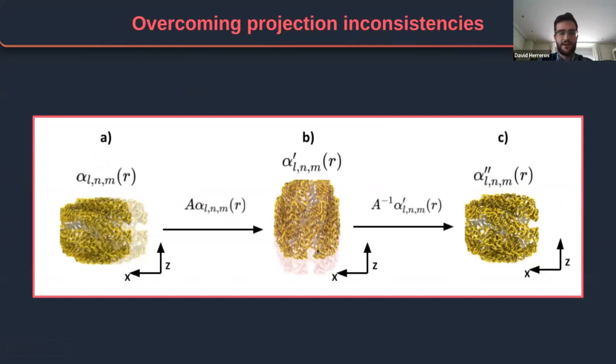So now the projection direction matches, for example, the z-axis. And now we know that the deformation field corresponding to the z-axis only contributes to this bad effect of not having experimental information along that direction. So we can completely remove that, then unrotate the coefficient space, and we get a much better and more realistic conformation from it.